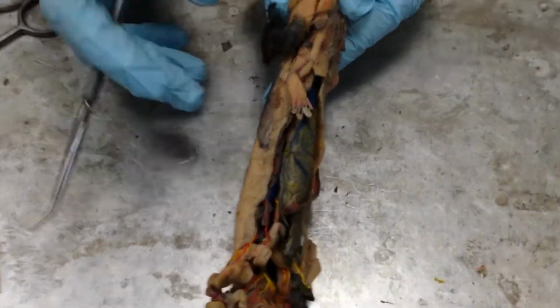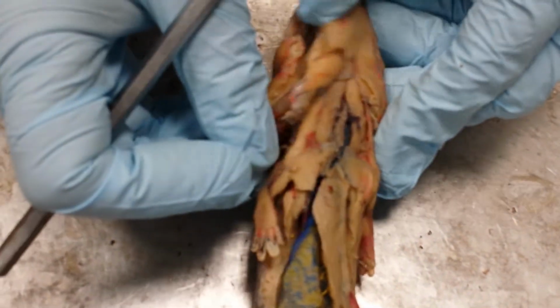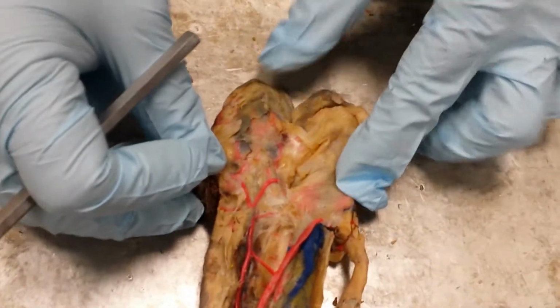So what you want to do is pick the side of the mouth that still has the gills attached, because you don't want to mess up your pretty muscles on this side. So you're going to cut down the side here, and you're going to flip open the jaw.